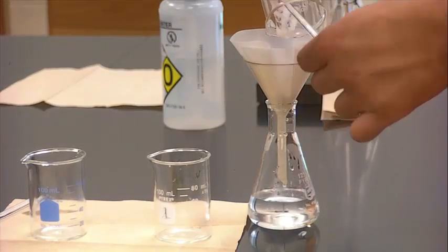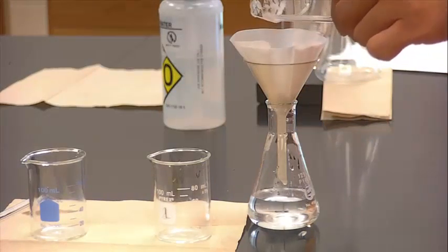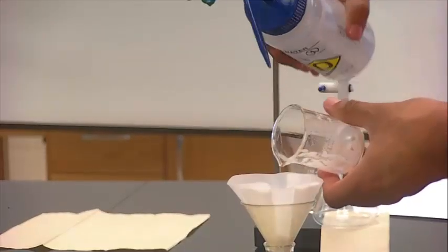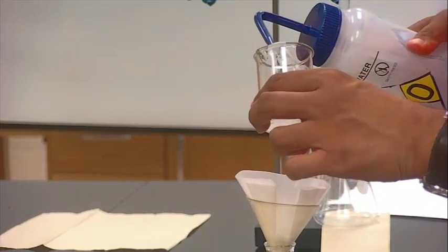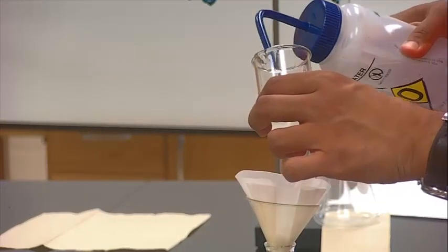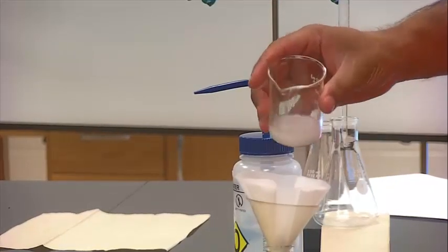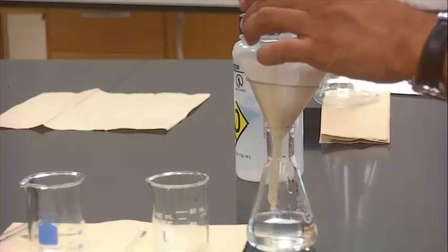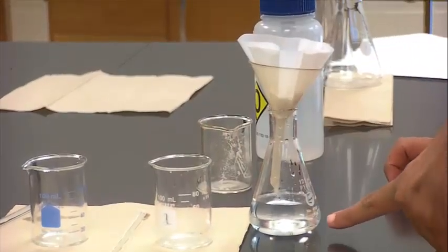This precipitate is in equilibrium with its component ions as well. So for all of this remnant stuff that has stuck to the side of my beaker, I can just do a little deionized water mix and get that in. Maybe one more round. That is finished filtering.